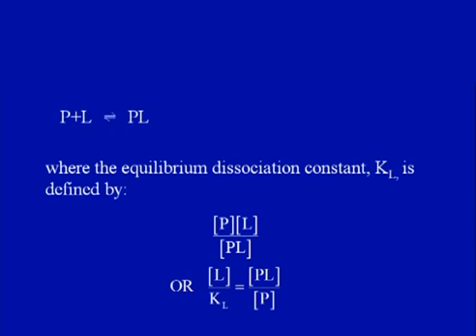So, these things need to be taken care of when you are choosing the size of the ligand. Now, affinity, like I said, the interaction of a protein, say P, and ligand L can be described as P plus L equilibrates with PL, and the dissociation constant could be given by this equation here.